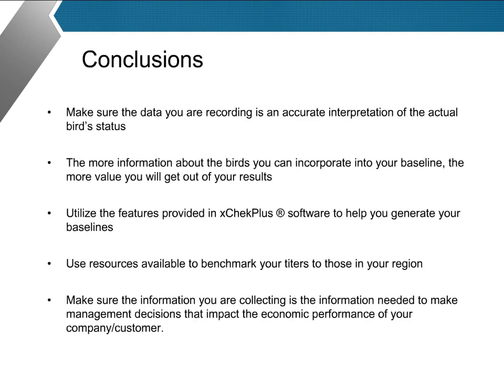In conclusion, you always want to make sure that the data that you're recording is an accurate interpretation of your actual bird's status. So your first steps are always to make sure that it fits the flock expectations. The more information about the birds that you can incorporate in your baseline, the more value you'll have from your results.